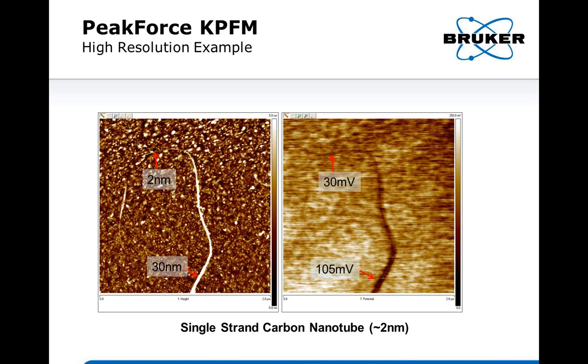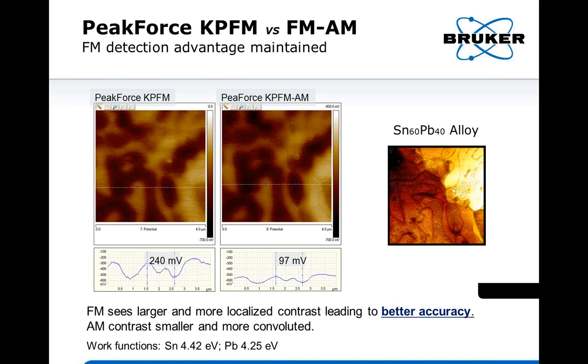Now let me switch to a different sample to see how it compares. Again, here I'm going to compare PeakForce KPFM FM and PeakForce KPFM AM. The sample is tin lead alloy, and it has domains around 100 nanometers or smaller.